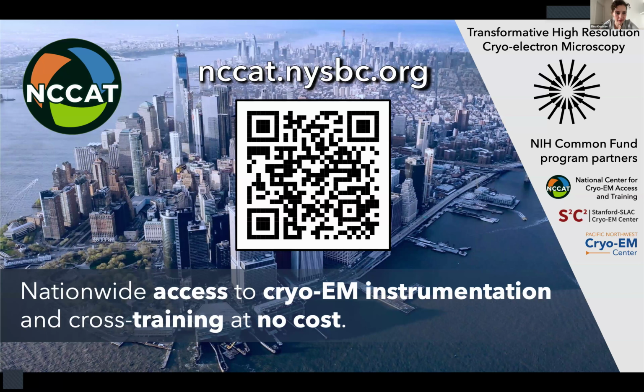Okay, and I'll update NCCAT. So at NCCAT, we offer data collection, sample preparation and screening, as well as 2 types of training. So very, very similar to other national centers. We have quarterly deadlines for proposals. In fact, next one is coming on October 1st.